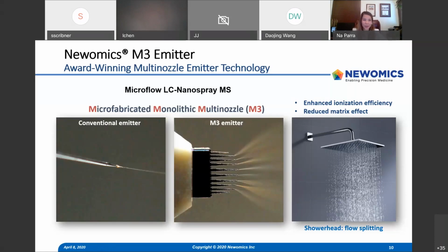Yes. So I guess it could be application dependent. Xiaojing, I would like you to address that based on the experiments that you have experienced. As Na just mentioned, it really depends on the molecules and the experiments. For our application notes 1 and 2, because they focus on peptides and bottom-up proteomics, those samples tend to be clean, and you also use organic solvent in the mobile phase.